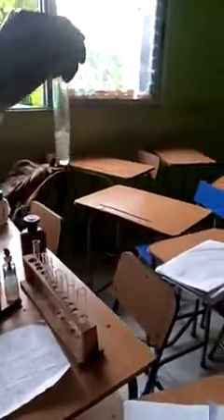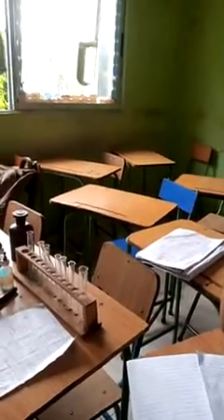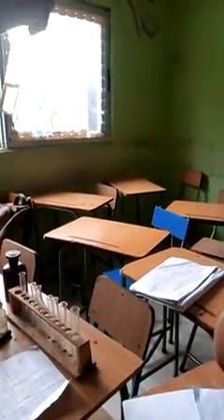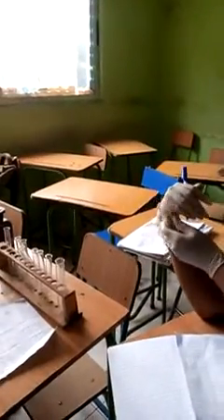Now, what is the color of the solution formed? It's a clear solution, but it has a color. Pale green. This is a pale green color, isn't it? So C dissolves to form a pale green solution. Yeah. So that is the first observation.